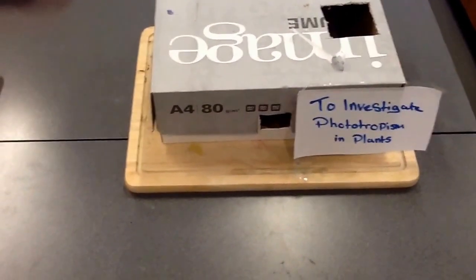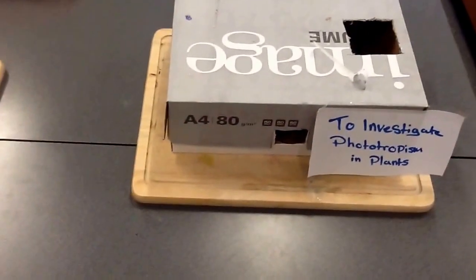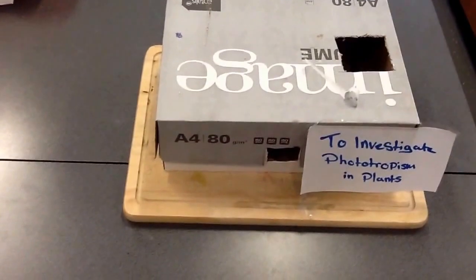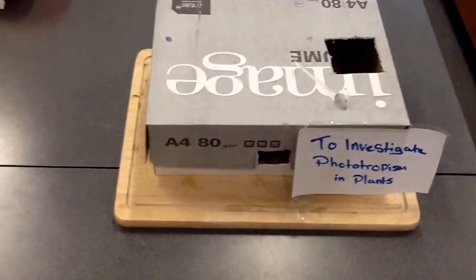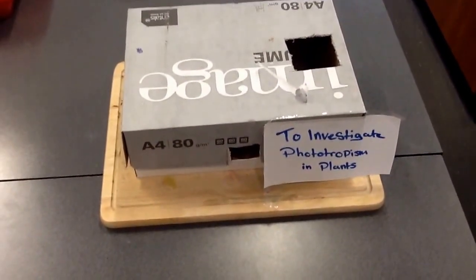Phototropism is the growth response of a plant towards light. Through the hole in the top of the box, in one compartment, the plants grew upright. In the other compartments, the plants bent at 90 degrees. Where there was no light, the plants just went yellow.